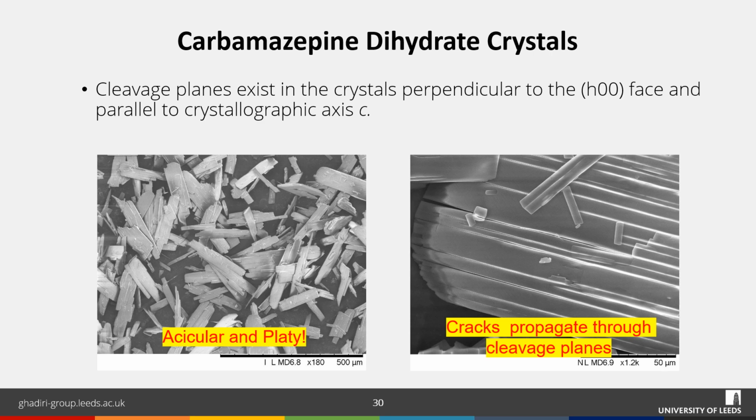Here we can see the initiation of crack propagation along these cleavage planes as induced by the vacuum inside the SEM. As the water evaporates from the crystals, cracks form on the surface of the crystal. Under normal conditions, this crack would not be visible, and the interesting crystal structure and the presence of cleavage planes of this compound make it a very nice system to study in our new test rig.